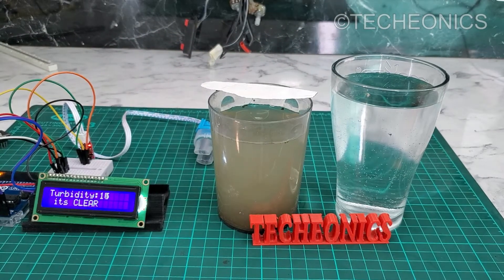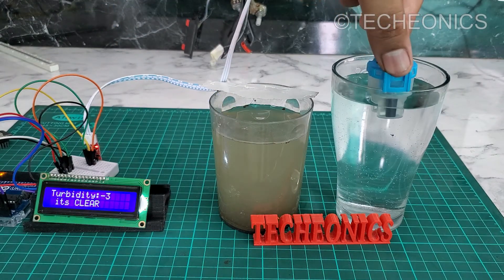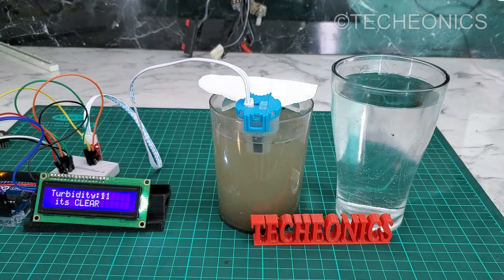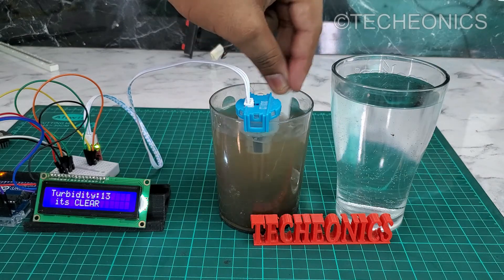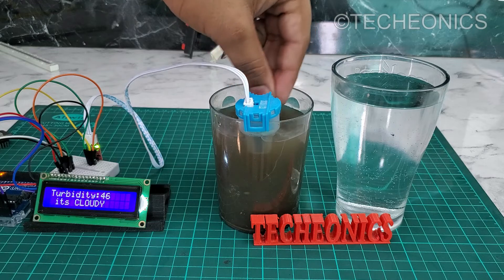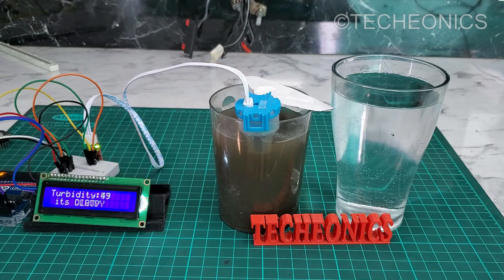Let's test the sensor. First, let's dip the sensor into the clean water. It's showing clean — that's good. Now let's bring up the dust sitting at the bottom. Now it's showing cloudy. Let's mix the sand more in the water. Now it's showing dirty. The sensor is properly working as you can see.